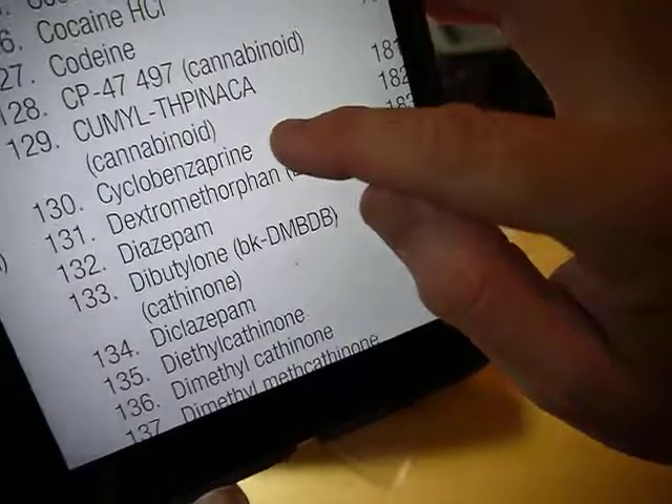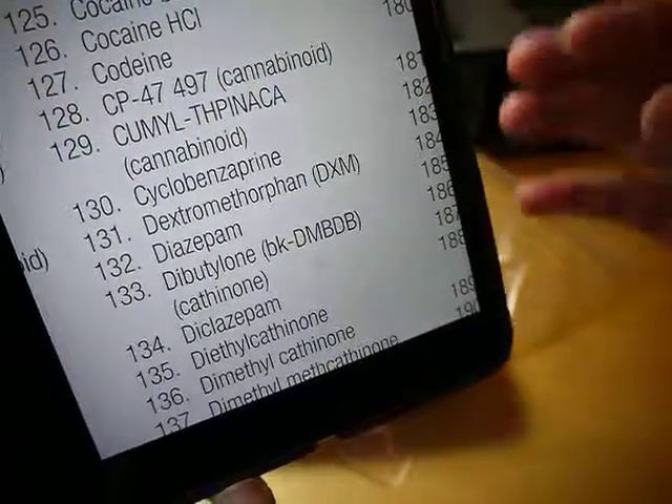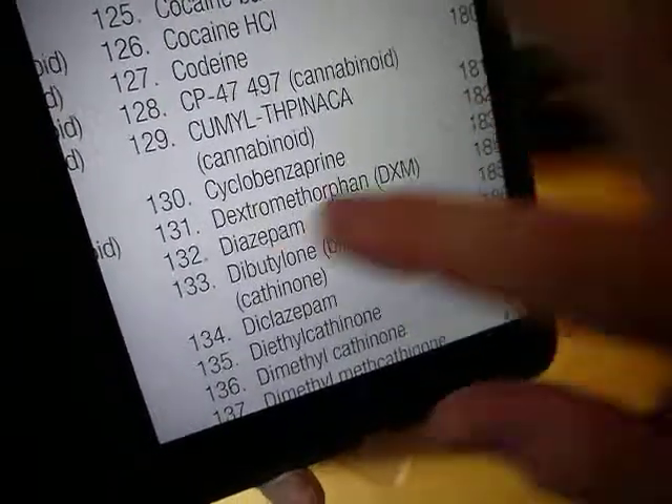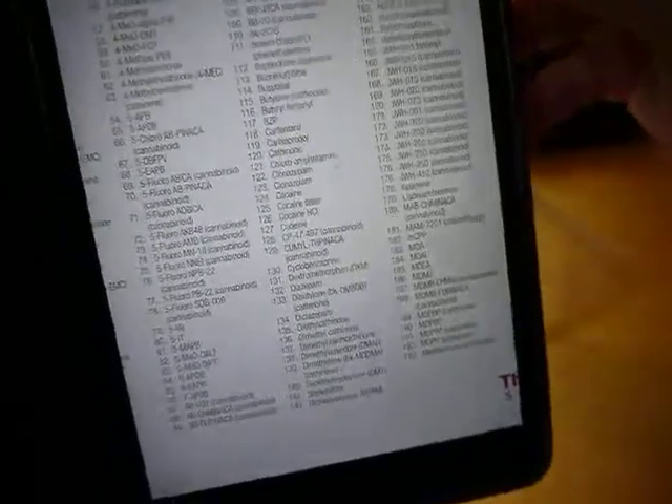Yeah, cyclobenzaprine — it's in this library, so that's why it was able to identify it. If it wasn't in this library, if it was an unknown, it would just come up and say that it doesn't know what it is.